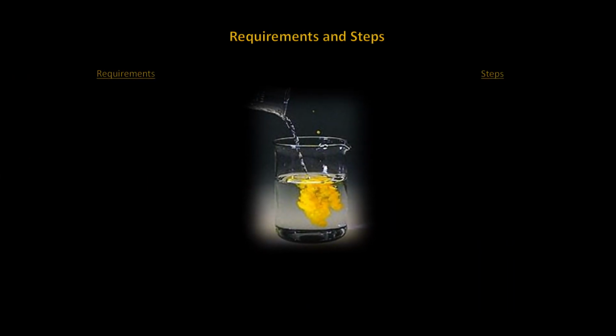In order to conduct a successful precipitative analysis, there are basically three requirements that must be met. The first is in regards to the reagents that will be used. The reagent must only react with the ion of interest. If this does not happen, then you may not get the desired precipitate. Others may form along with the one needed for the analysis.